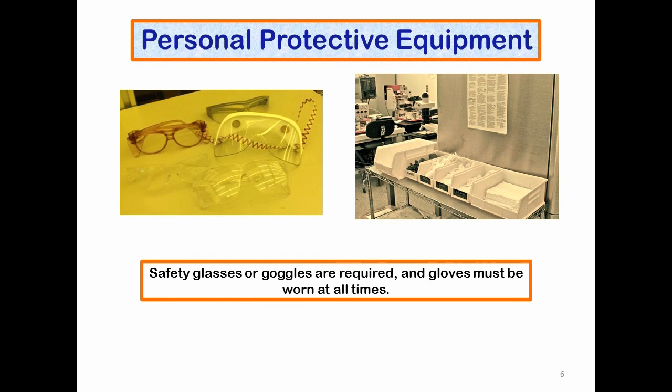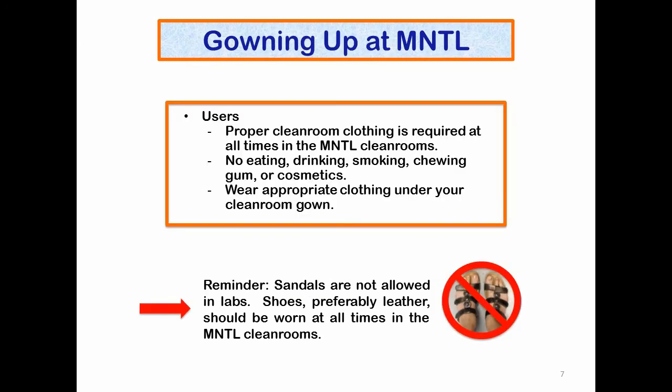So PPE, personal protective equipment. Everyone is required to wear safety glasses or goggles at all times. Gloves must be worn at all times. So your cleanroom suit does give you some protection, but always keep eye protection and hand protection on when you're working in the cleanroom.